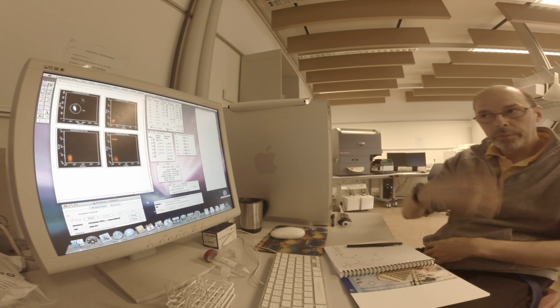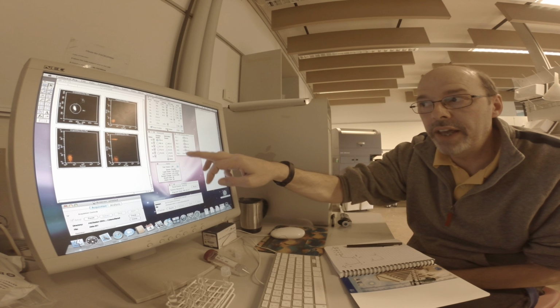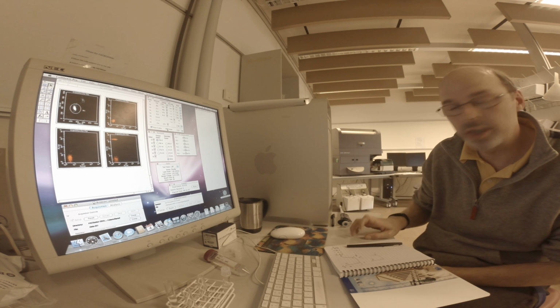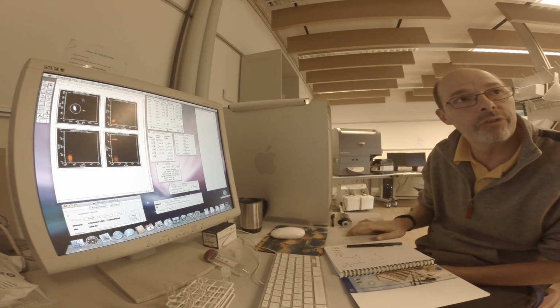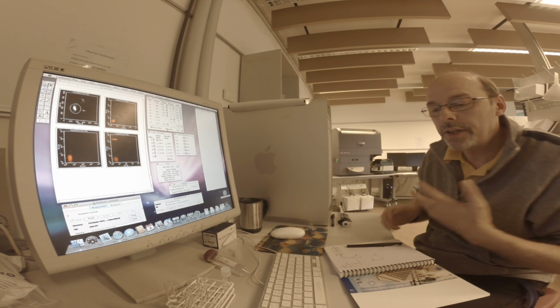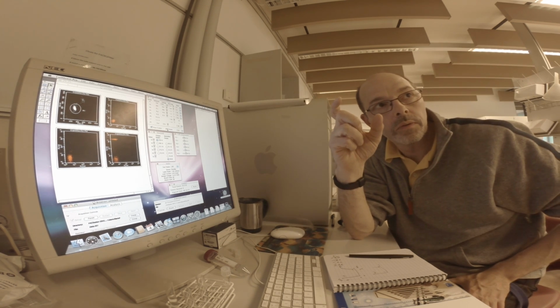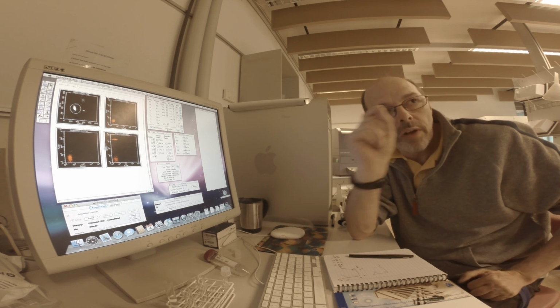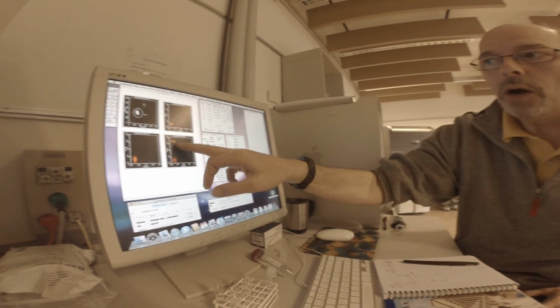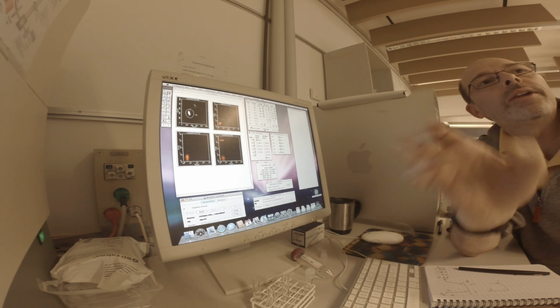Exactly. But it's just that the software you are building must take into consideration that they have to play around with it. Yes. So whatever number they want, it doesn't have to be a sliding bar. It could just be a number that they punch in. Say, I want 1.4 or 1.5, and then see the result, right? And it's just, if we can get these two to interconnect and reflect what is going on, for one thing, the student will learn more. Because they will see the relationship. The other thing is, now I have set this one, and also the other one, and said to you, I have set the compensation, I have lined up the instrument correctly.